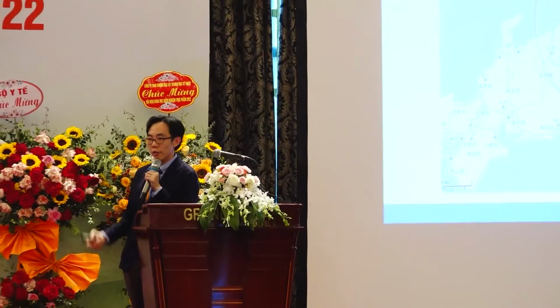Lastly, let me run through this quickly: looking at radioactive isotopes in ICP-MS. An important date for our Japanese colleagues: March 11, 2011, when the great earthquake happened, and there was a nuclear disaster at the Fukushima nuclear plant.